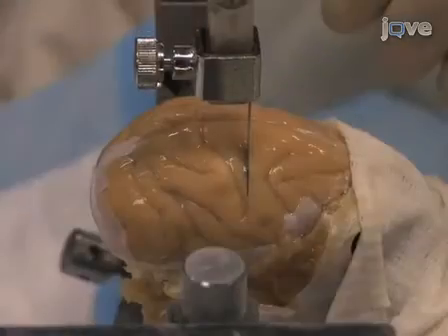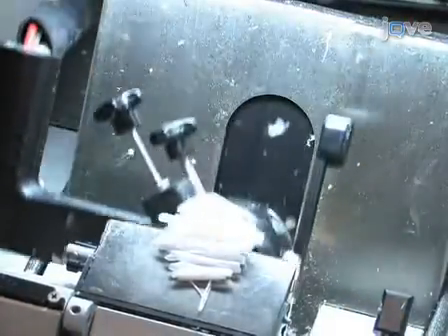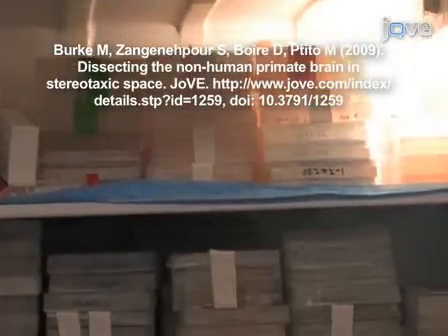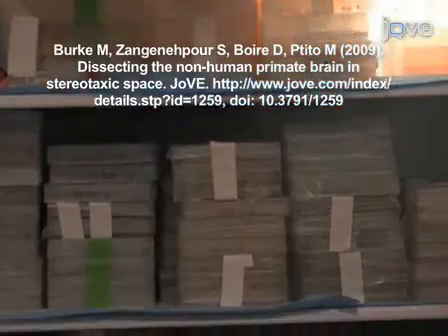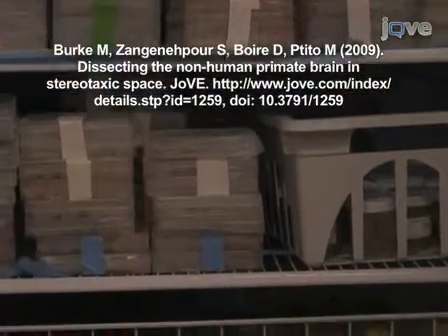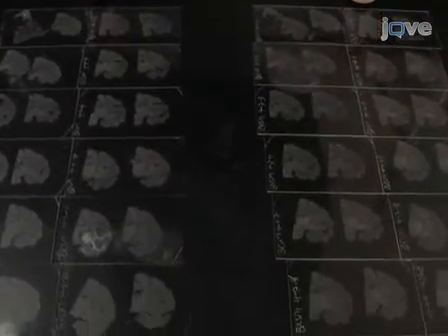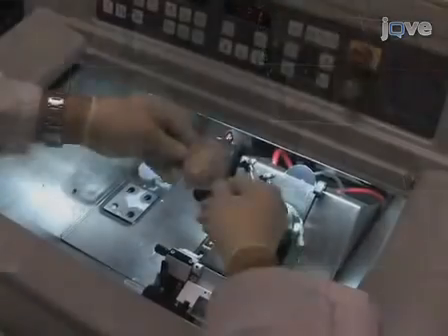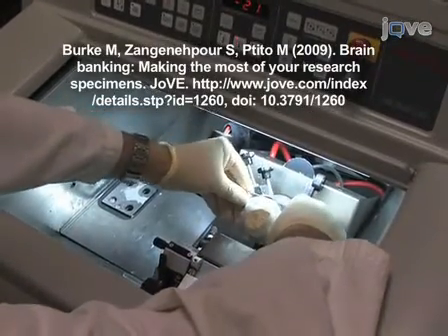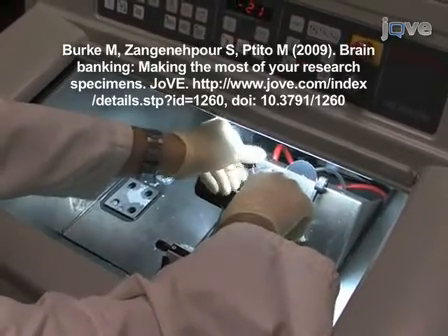as paraformaldehyde. The brain should be blocked in stereotaxic space, cryoprotected and frozen. To see these protocols in detail, consult our recent JoVE article, Dissecting the Non-Human Primate Brain in Stereotaxic Space. The brain should be systematically sectioned to contain all of the reference space. To see this protocol in detail, consult our recent JoVE article, Brain Banking, Making the Most of Your Research Specimens.